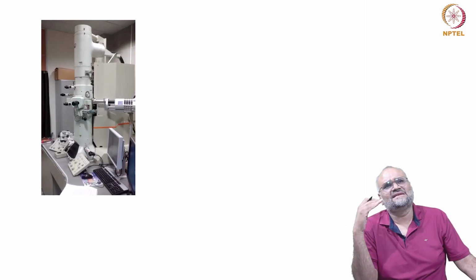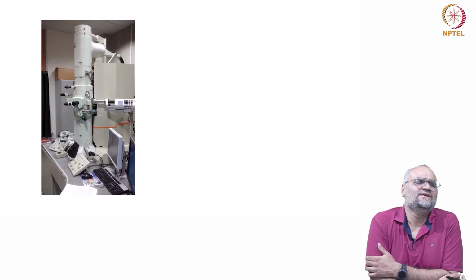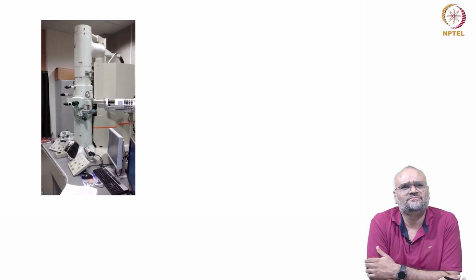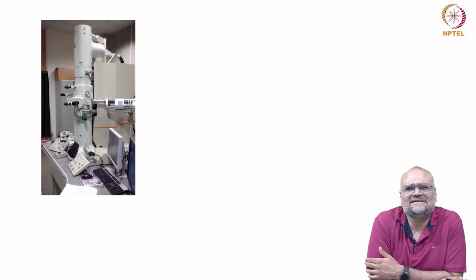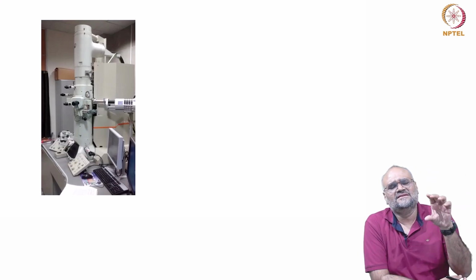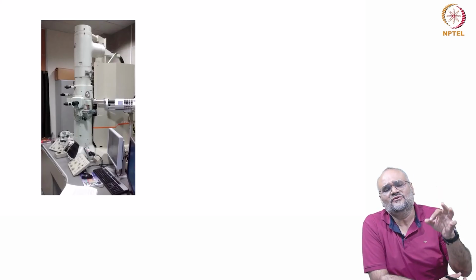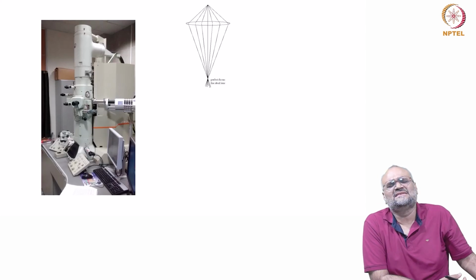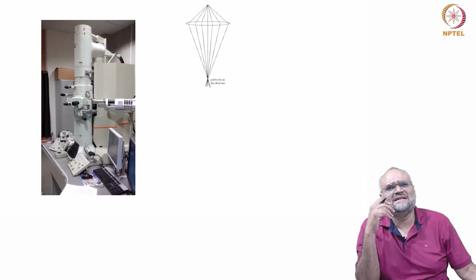What happens when you go to the micro probe mode? You are actually fixing the potential of the objective lens, and there is hardly any influence of the objective lens on the image that is formed. Typically, the manufacturers such as Thermo Fisher measure it in terms of percentages. It is fixed at somewhere around 88% or so, depending on the instrument configuration. The objective lens currents do not change anymore, and once it is done, you form a probe, primarily using the condenser lenses, the combination of however many condenser lenses you have.